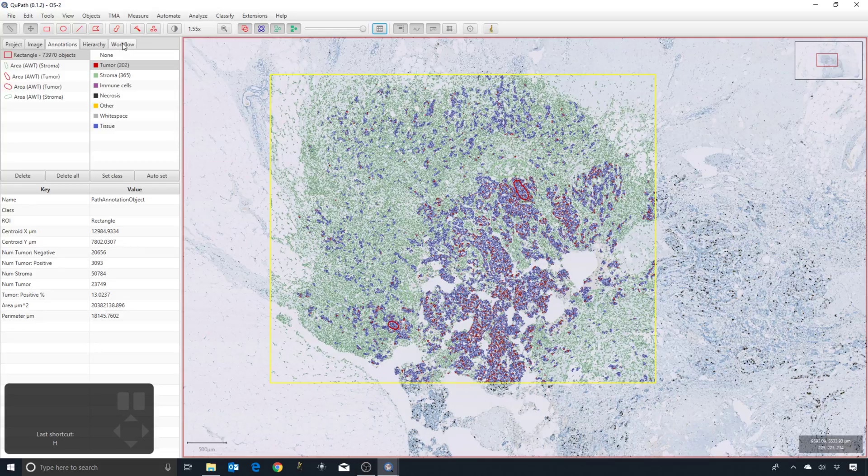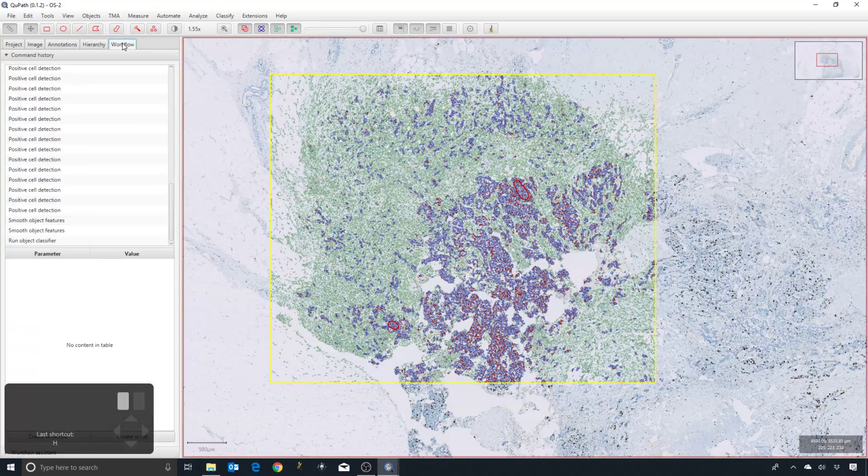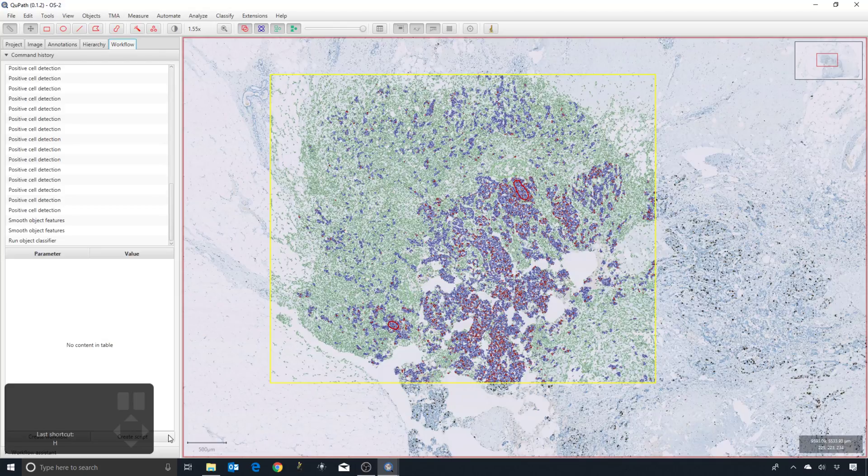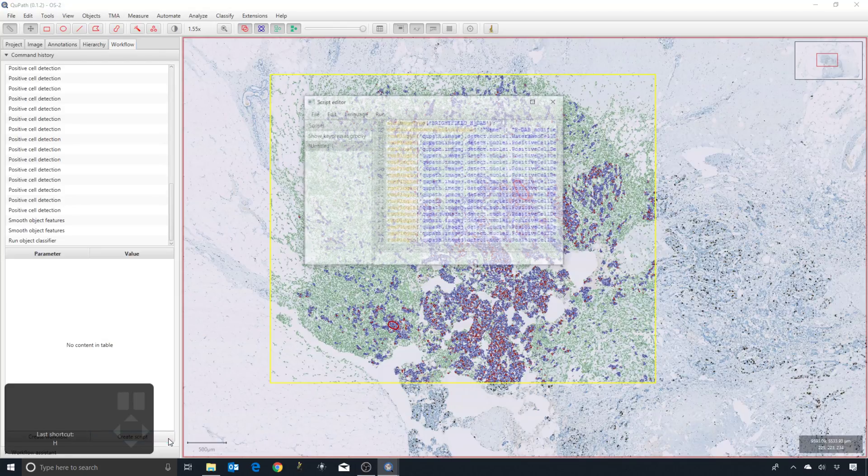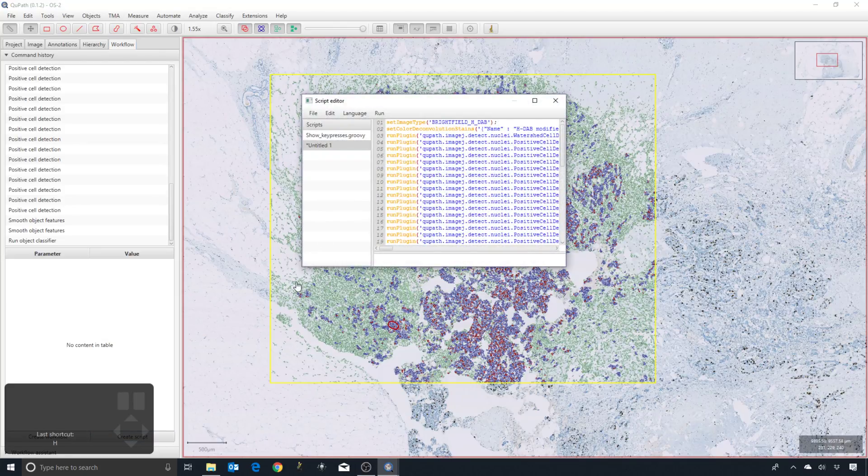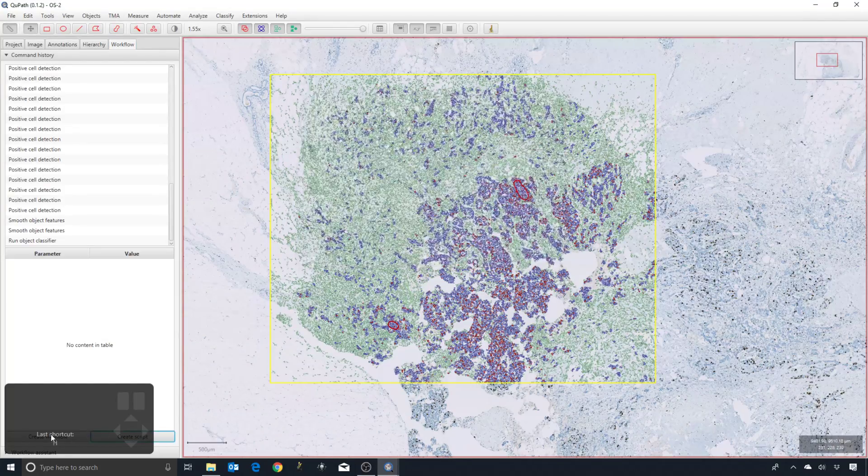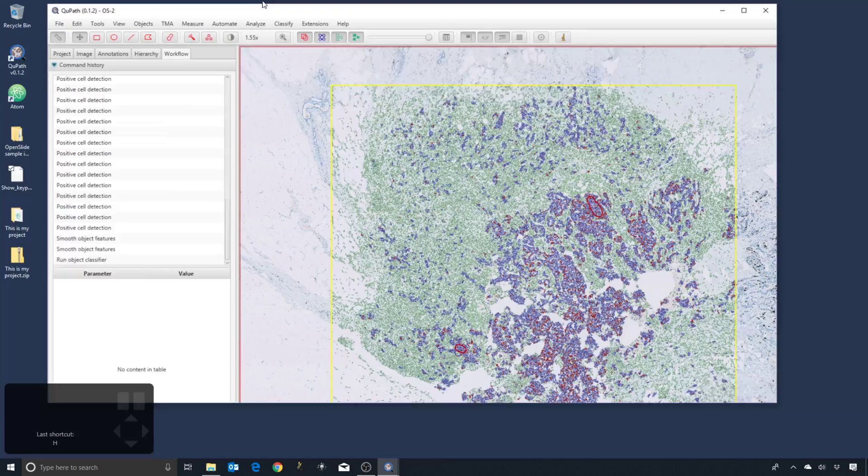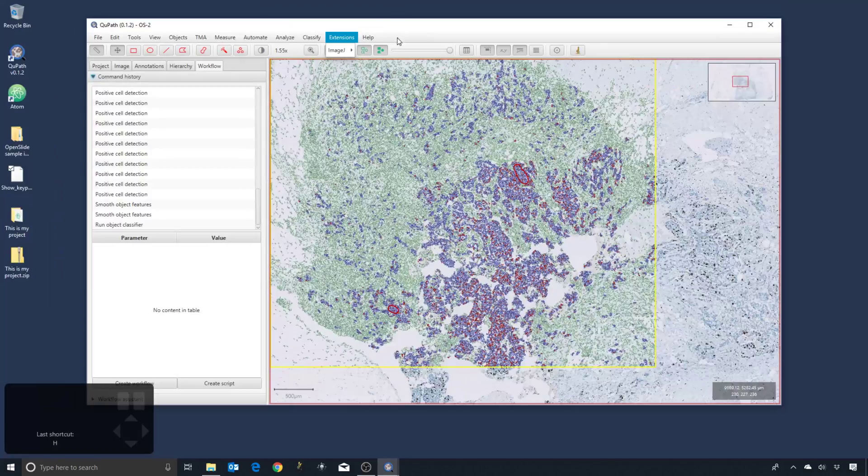So down at the bottom there is a button 'Create Script' and beside it there is a button 'Create Workflow'. I'm going to have to move my window so that you can see it.